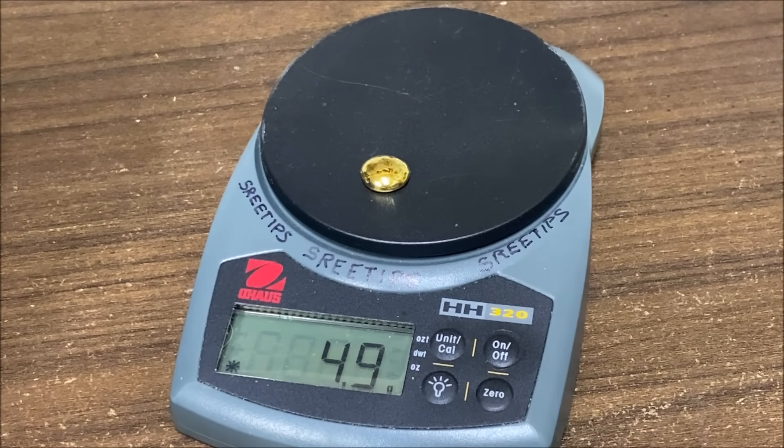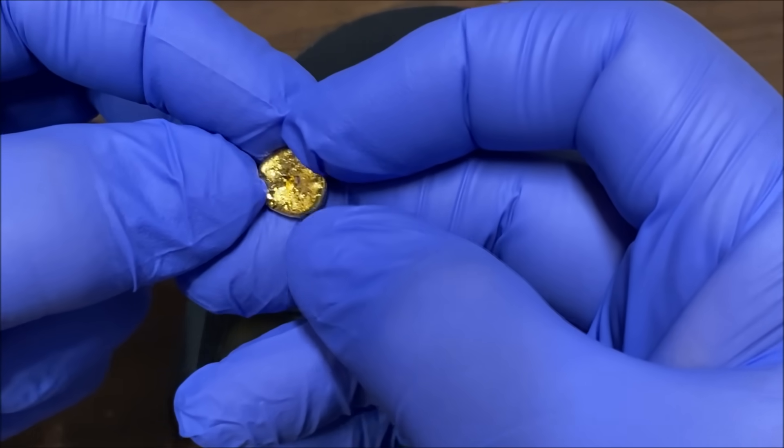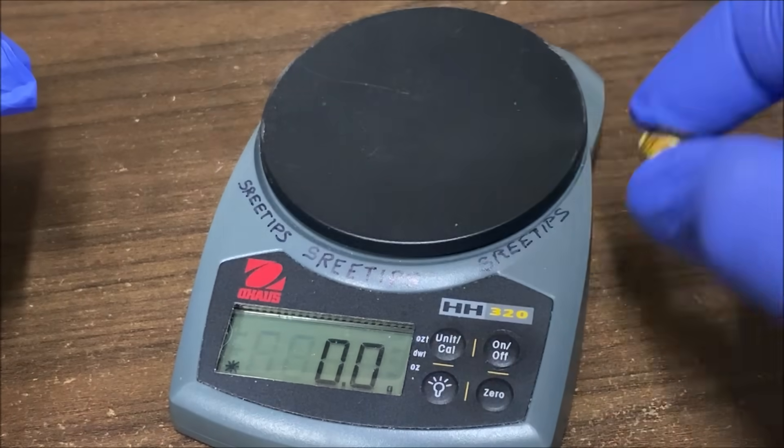It reads 4.9 — it flashed to five there for a second. So we might have had a little bit of loss during the refining process. The gold here — that's valid. I think the bar marked 9999, five grams of pure gold, was in fact correct. We've just verified that the correct markings were on that bar.